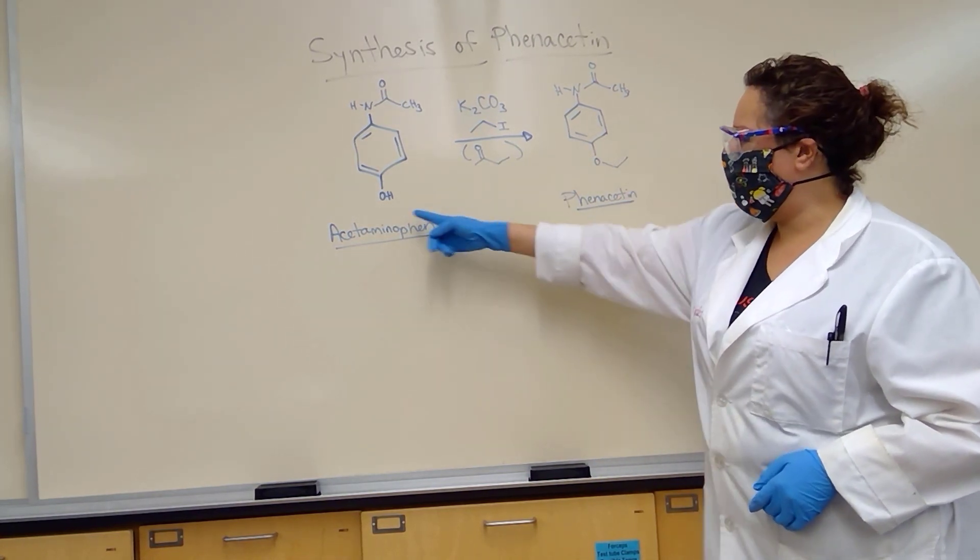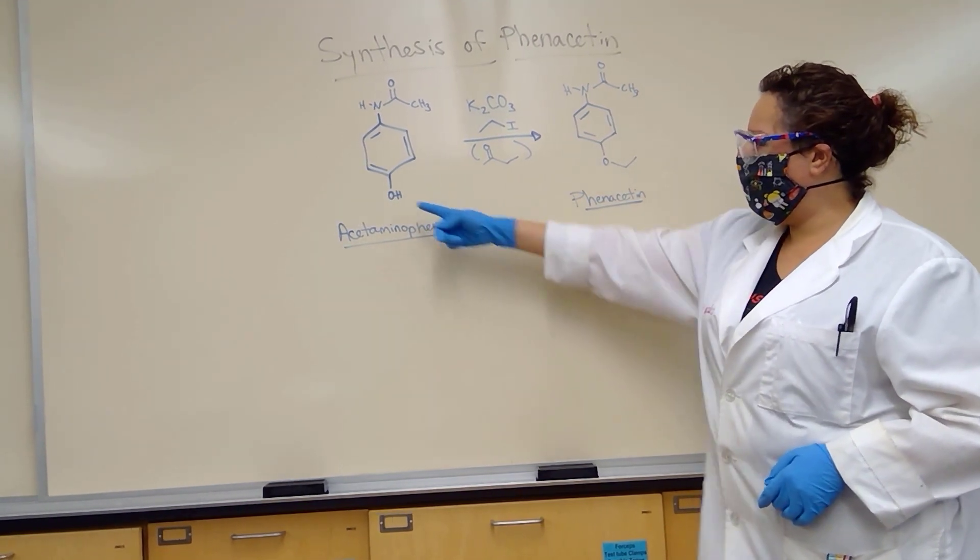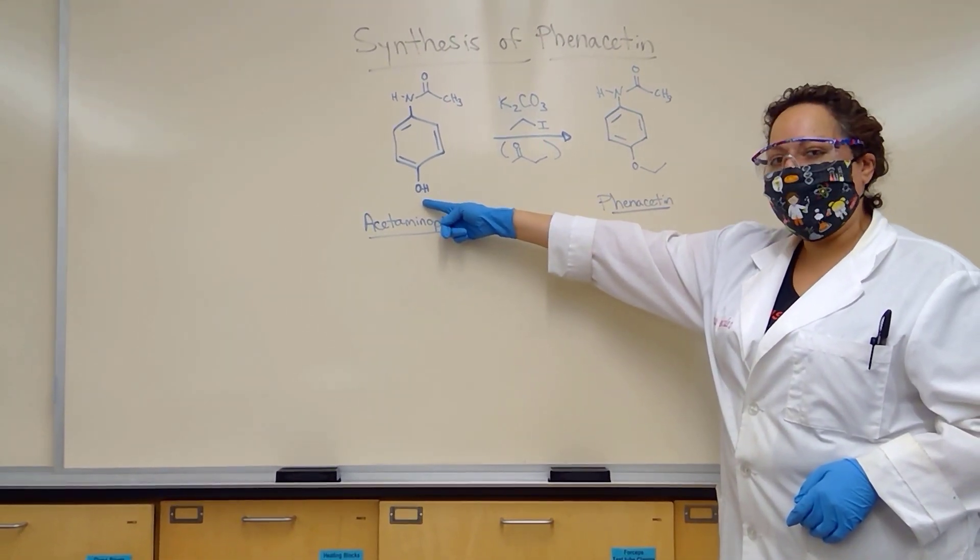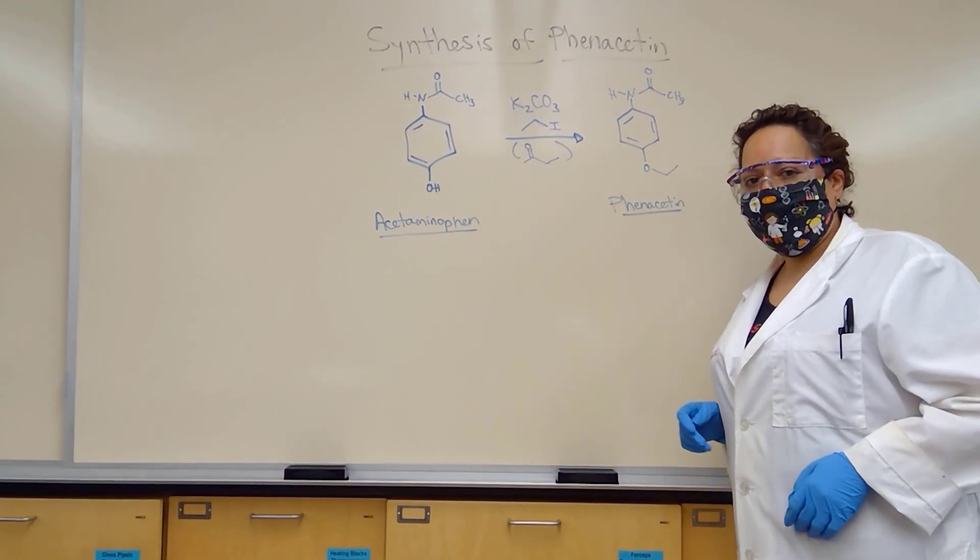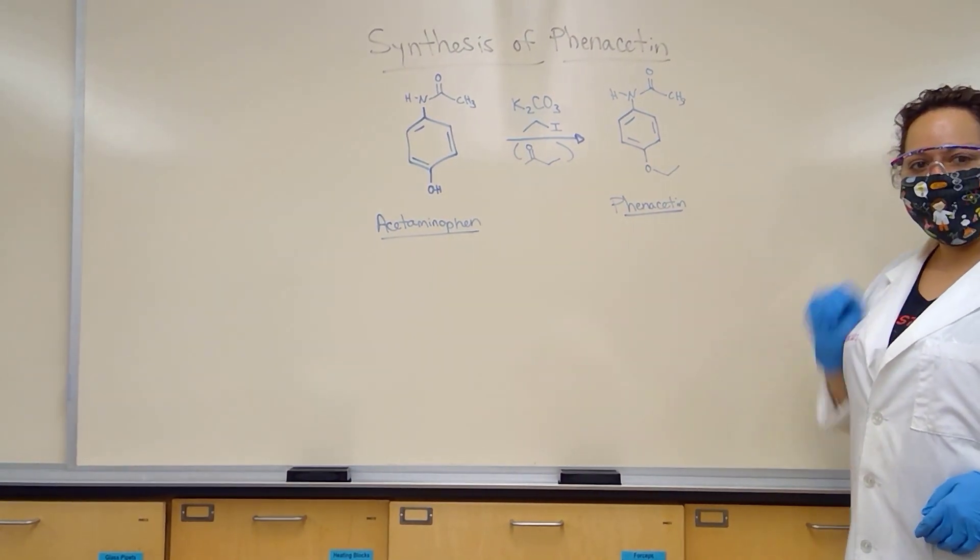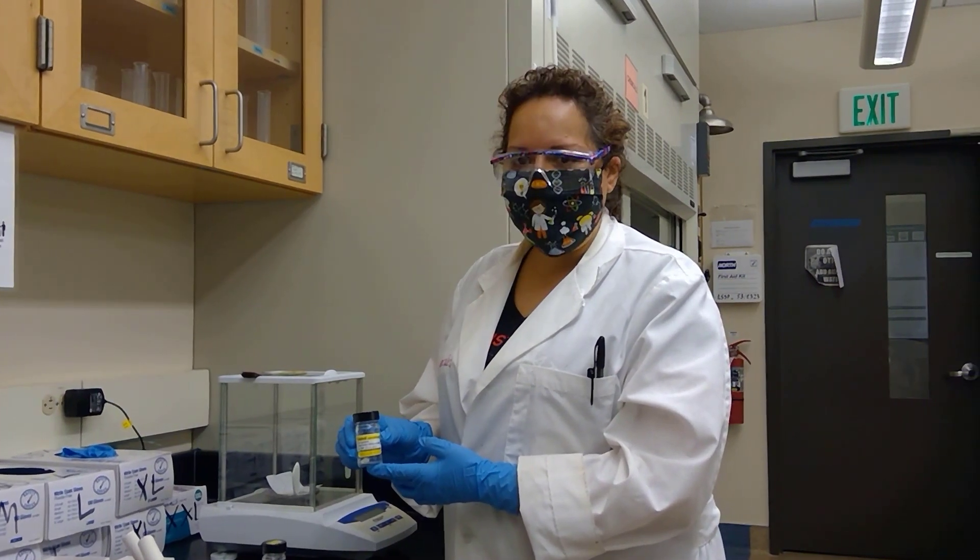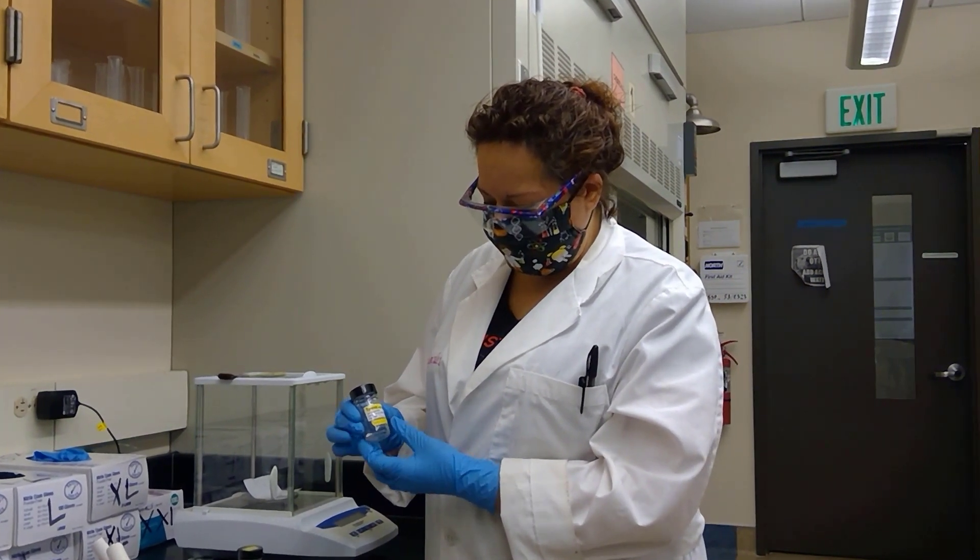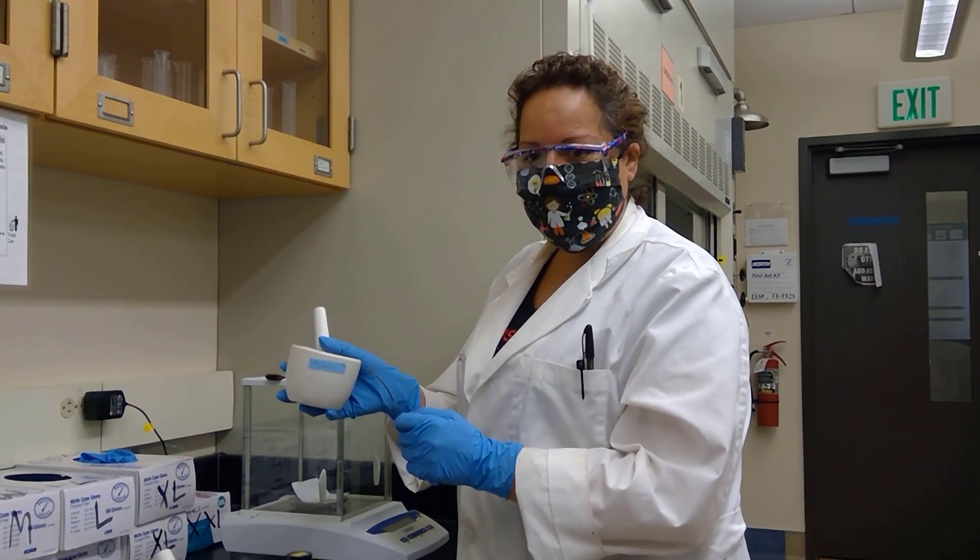The goal is to deprotonate our acetaminophen's alcohol and allow the oxide to do an SN2 reaction on ethyl iodide. Once that is accomplished, we will generate the compound known as phenacetin. We are starting this experiment by crushing up some extra strength Tylenol, and I will measure 0.22 grams of the crushed Tylenol.